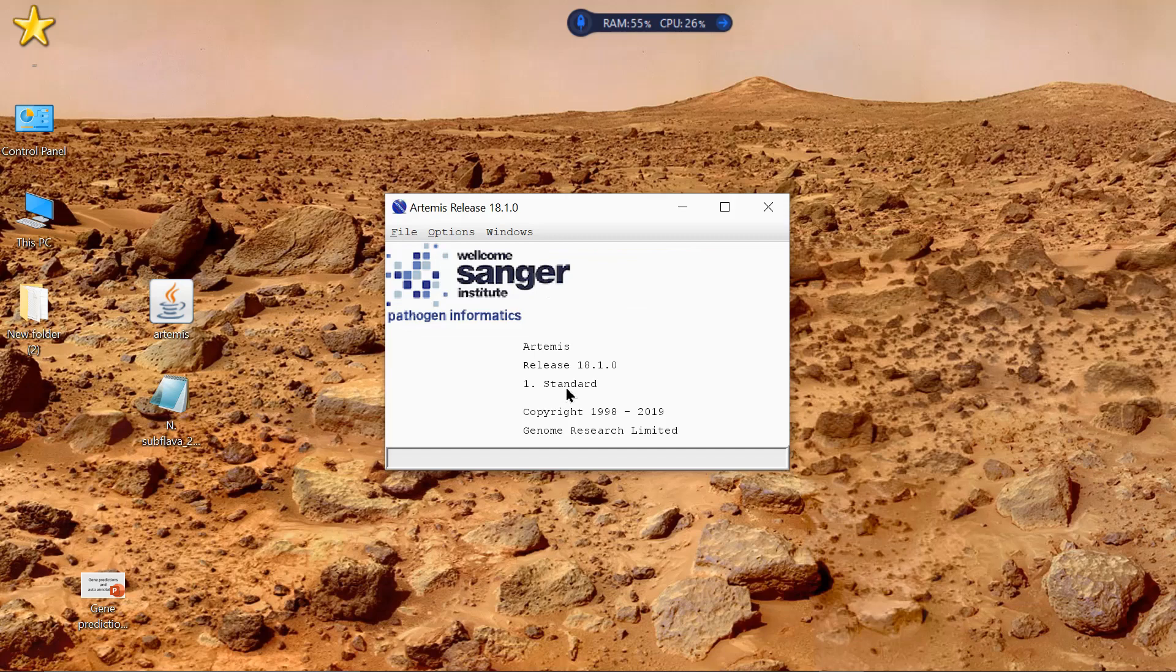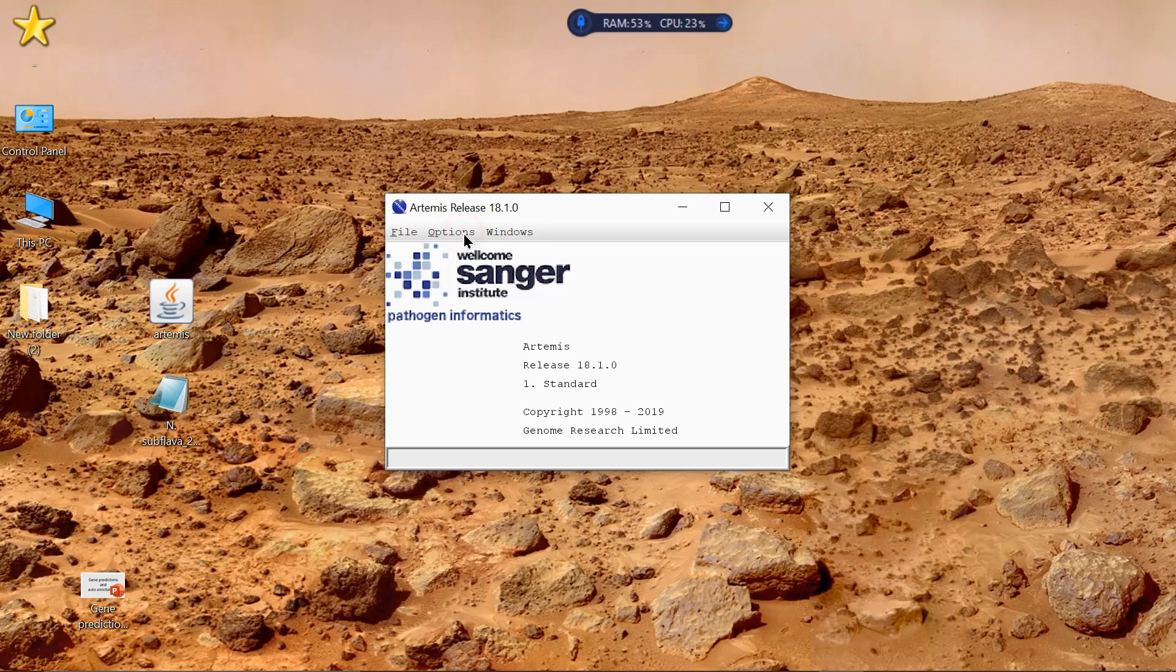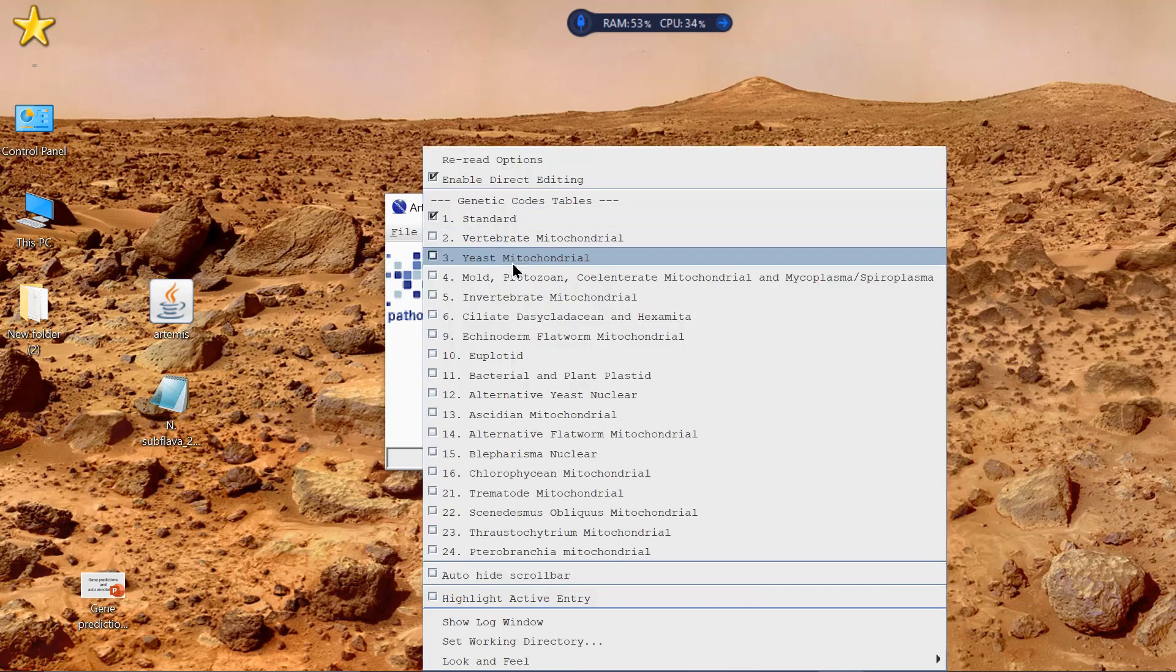Now, as you can see here, Standards, that's for the genetic code that you'll be working with. In this case, you go on Options, and select Bacterial.